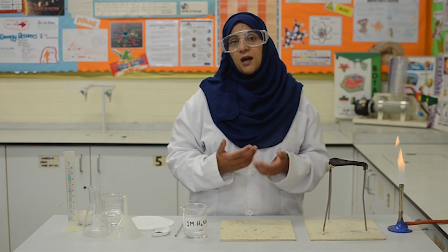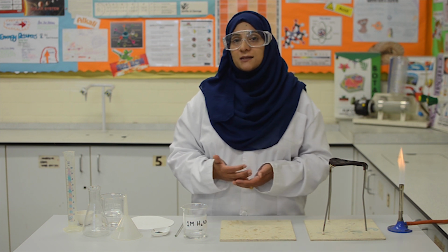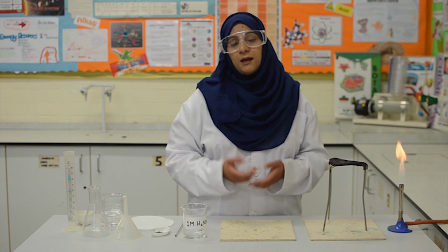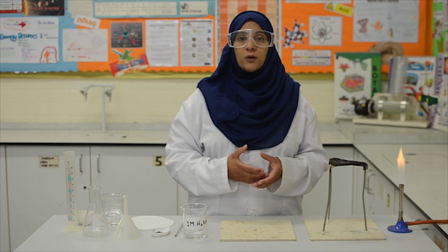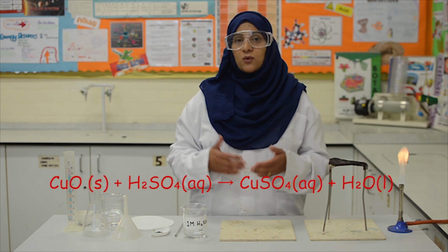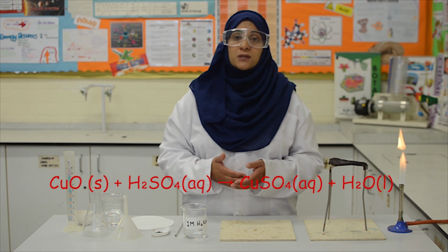Metal oxides and hydroxides can react with an acid to produce the corresponding salt and water. In this practical, we will be looking at making copper sulfate crystals by reacting sulfuric acid with copper 2 oxide.